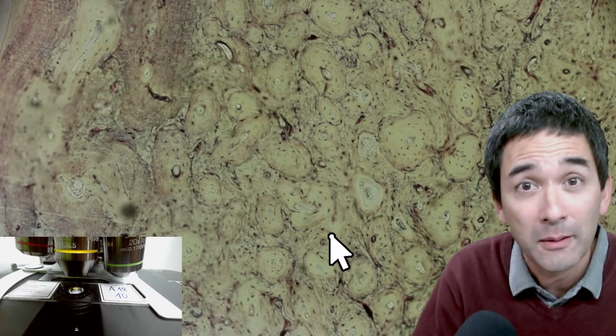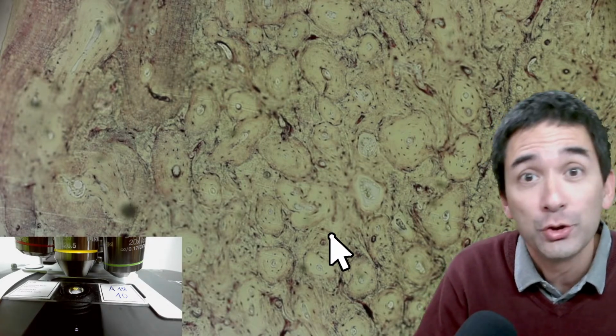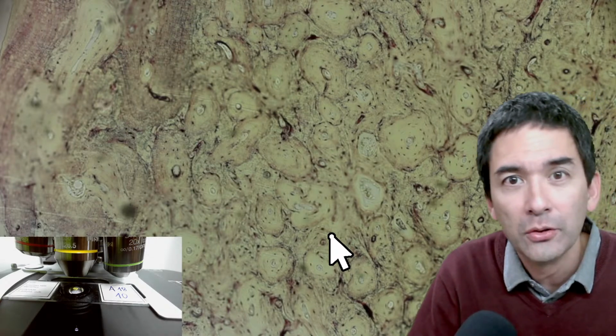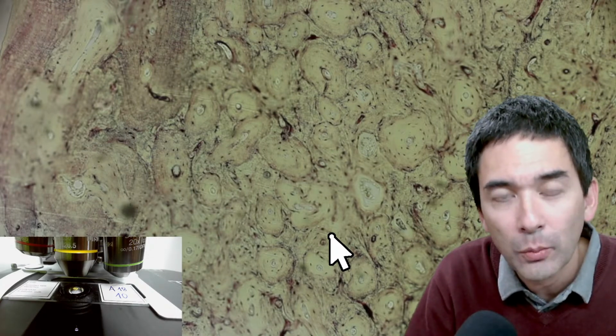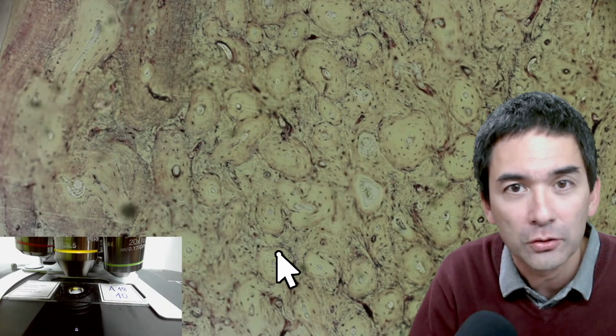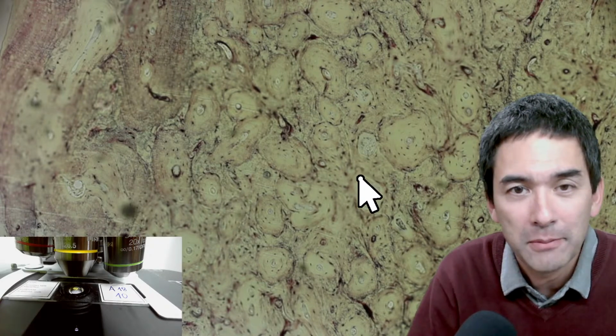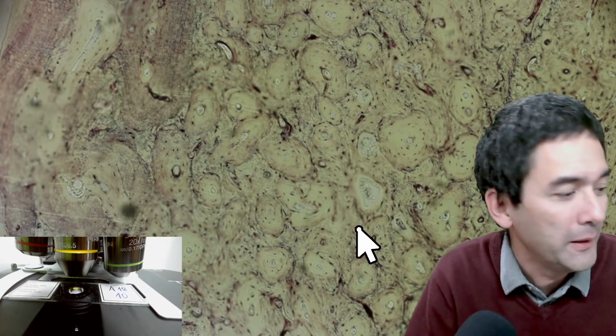And I was thinking maybe you have to download some additional software and complicate it and everything. And I could not find any information, and then I realized why. Because there is no need for anything. You just put a piece of graphic over it, and then you can move it around. That's why it was never explained, because it was already included as a feature anyway.